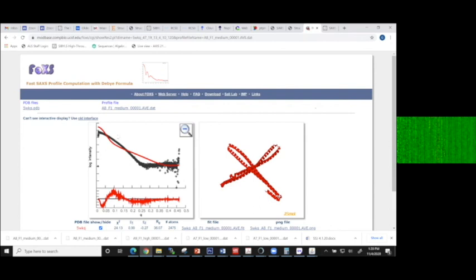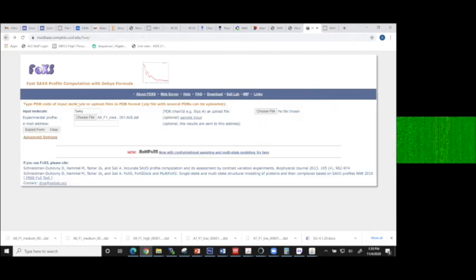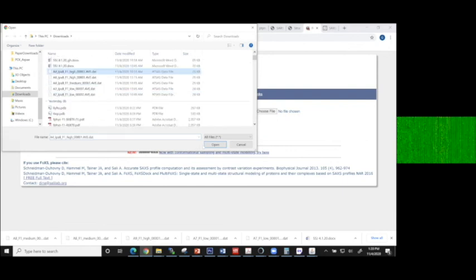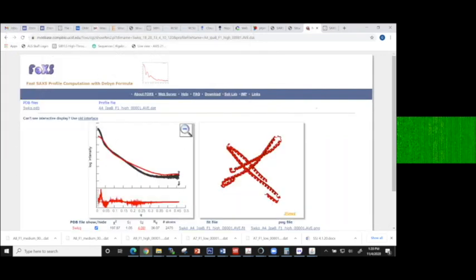But not perfectly. Oh, let me do that again, sorry. Let me choose the right one. It was A2, A4. Yeah, so that's the comparison of the two. It resembles it, but what is in solution is bigger than just this thing.